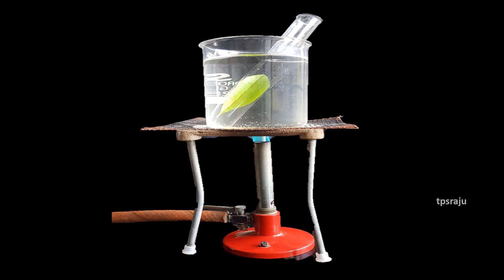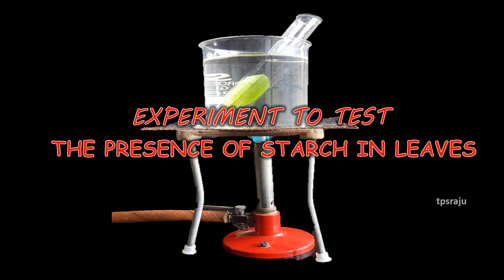Hi, good morning. Today we are going to do an experiment to test the presence of starch in leaves.